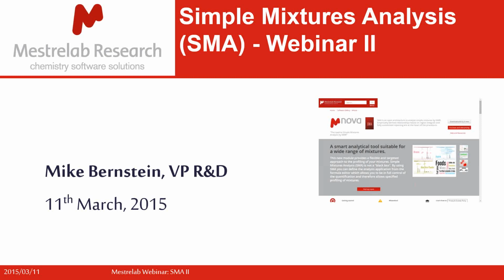So the idea here is that we're going to move from what we spoke about in the first one, which was largely around usability and general themes about the software, and now delve into the specifics of how you would actually set it up largely for yourself, for your particular analysis. So I will start with reviewing a few slides from last time, just to get everyone on the same page, so that you can see this on its own and it makes some sense.